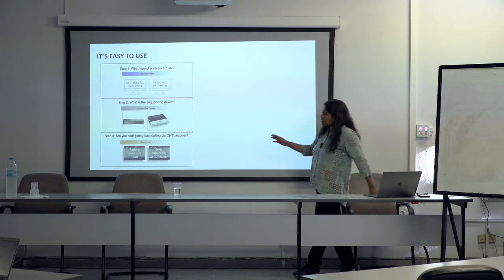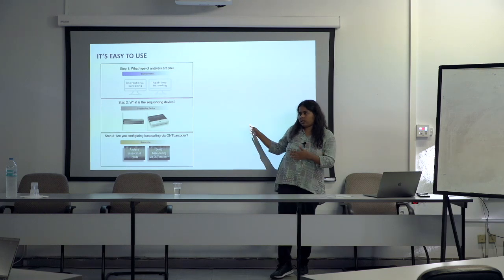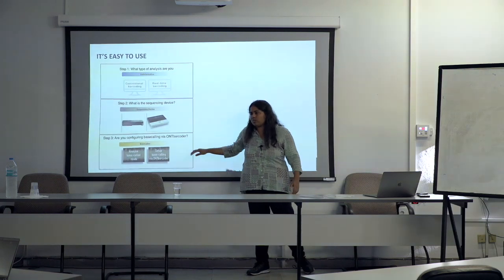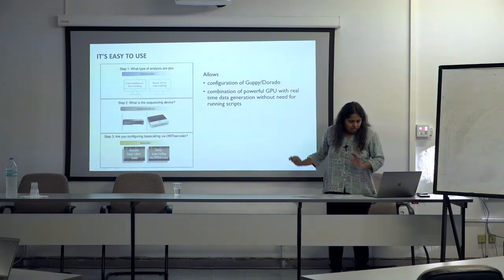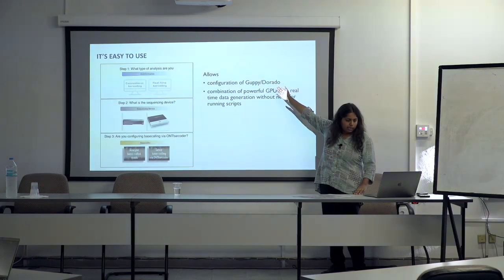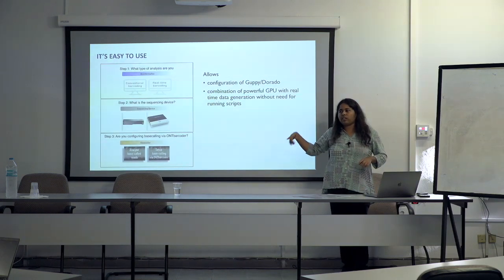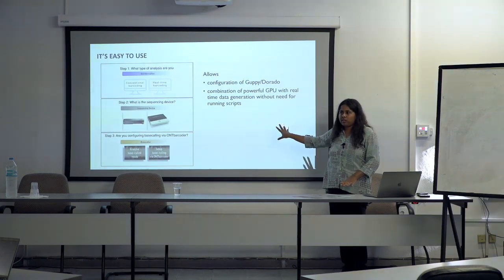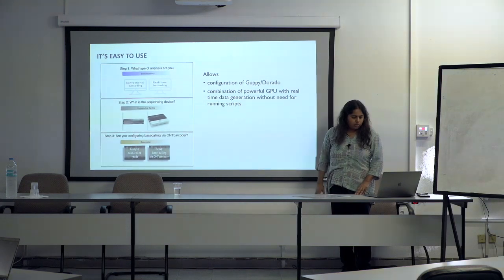So in this case, if you have an Ethernet cable with the sequencing device and you want to do it on a different computer, this can work as well. You just connect it to your base calling device. And we have linked it to Guppy and Dorado within your computer, so if you want to do base calling on a separate computer and monitor this, it's also doable. The most recent update was with Dorado.